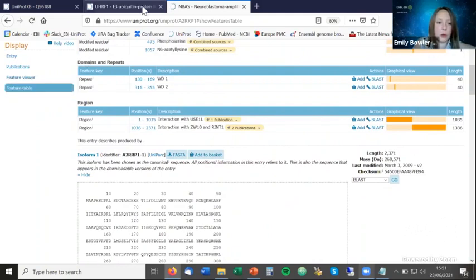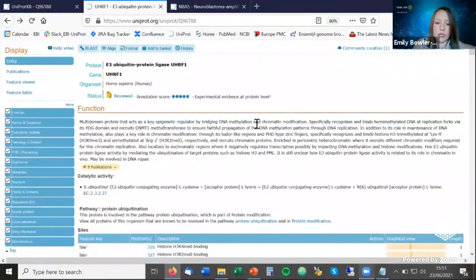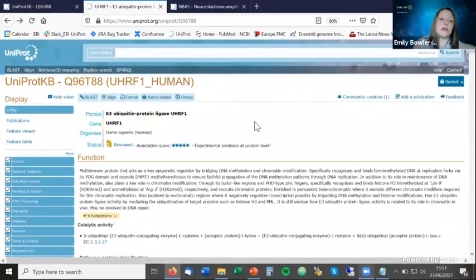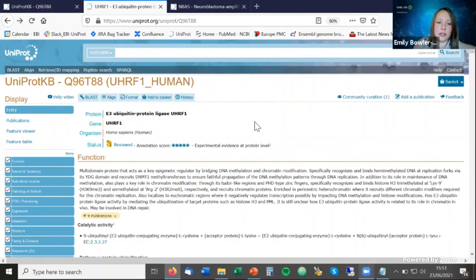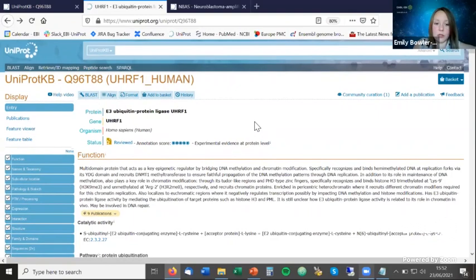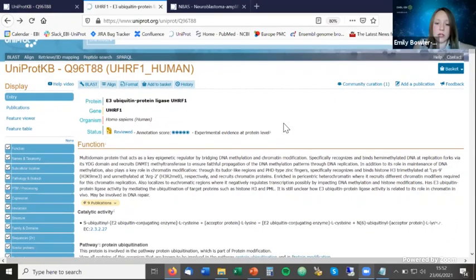All the same information visible in the Feature Viewer is also available in a Feature Table view, which is more compressed. I've now gone back to the main protein entry page for UHRF1. I'll show you how to extract the full amino acid sequence, since many databases and tools require the full canonical or isoform sequence for further analysis.